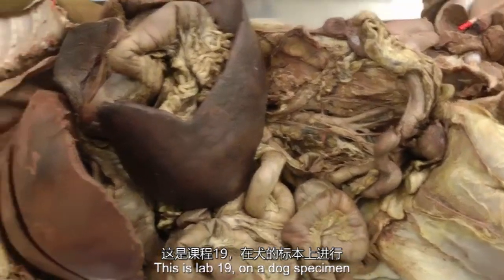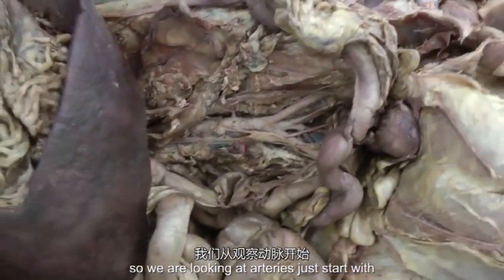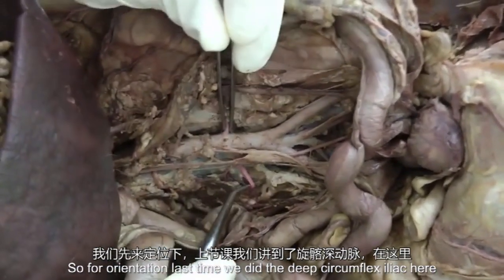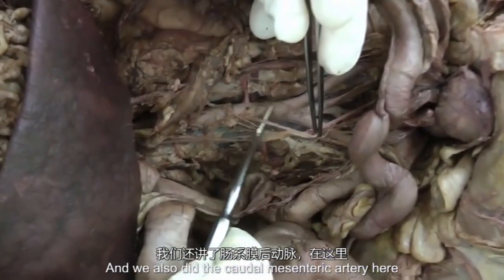This is lab 19 on the dog specimen. Today we're finishing up the terminal aorta, so we're looking at arteries to start with. For orientation, last time we did the deep circumflex iliacs here, and then we also did the caudal mesenteric artery here.